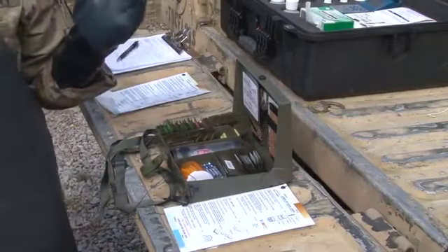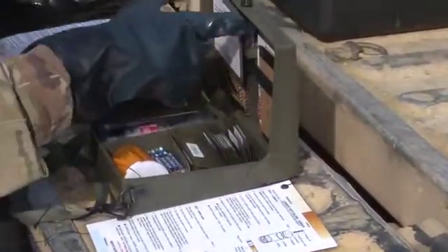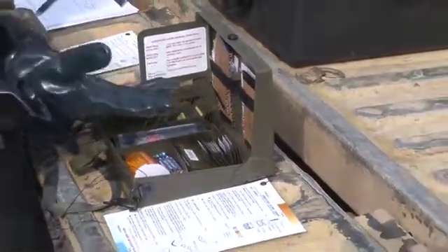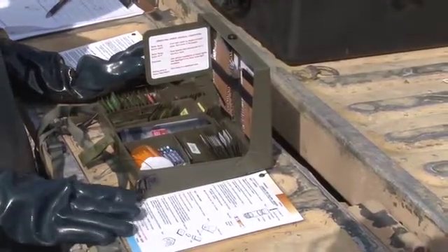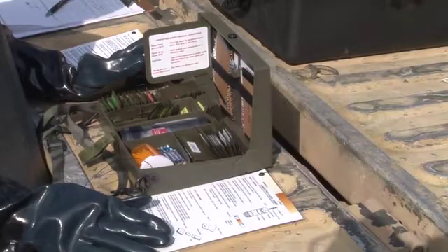Now that you have your protective gear on, you are ready to perform the lewisite test using the M272 Chemical Agent Water Test Kit. Lewisite is a blister agent which causes immediate pain on impact. It is an effective irritant to the eyes, mucous membranes, lungs, skin, and blood-forming organs. It was developed for use in chemical warfare. It is your job to test for this agent in water samples.